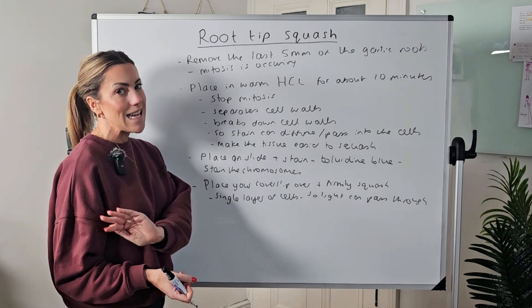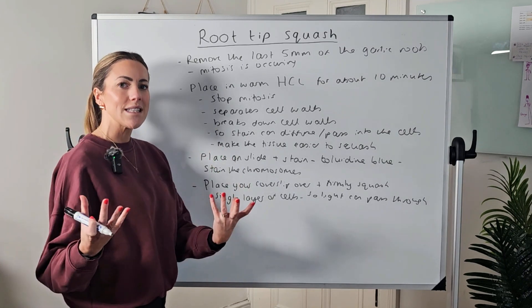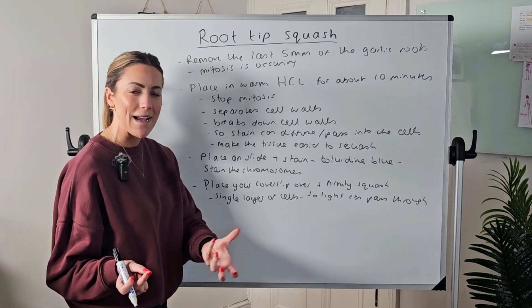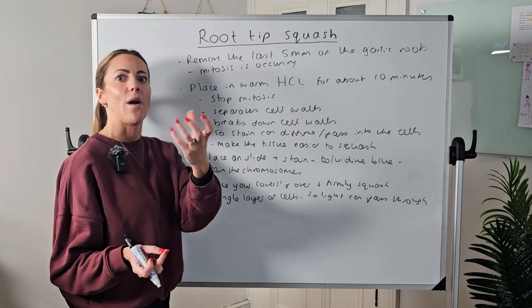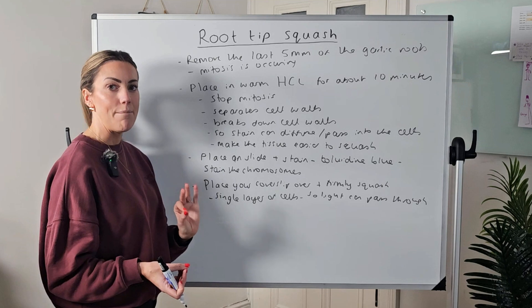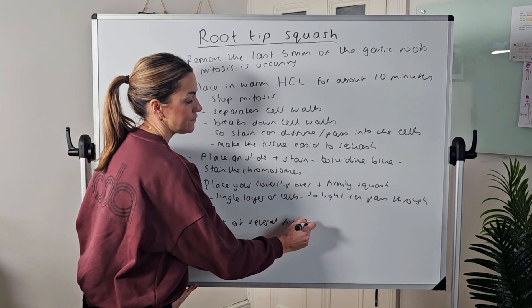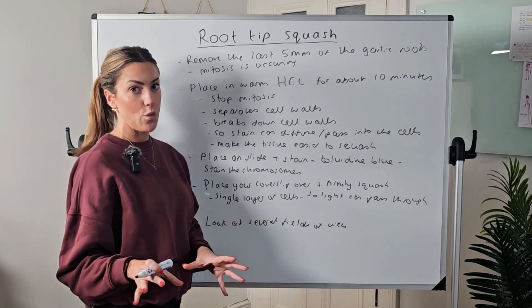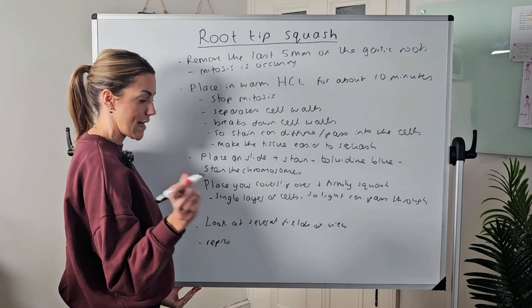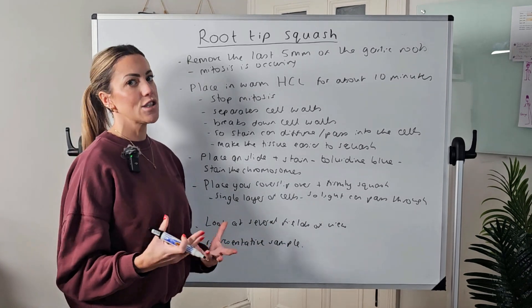Once that's done, place your slide onto the stage of your optical or light microscope. Always start on the lowest magnification because it gives the widest field of view and is much easier to focus. Once focused, you can increase the magnification by turning to a higher-power objective lens so you can actually identify the stages of mitosis and see the chromosomes clearly. You're going to look at several fields of view — not just one — in order to calculate the mitotic index, because a larger sample size gives you a more representative result.